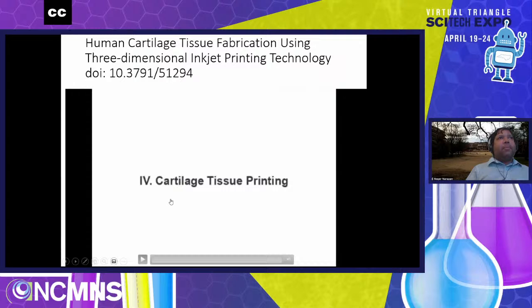And you can see that the inkjet printer looks just like a printer that comes out of the store. They, in fact, even have to disable the paper sensor so that it doesn't sense that there's paper underneath. So you take something directly from your local store and do something very similar to this with plant cells or with other things in your environment with a lot of polymers that are out there.